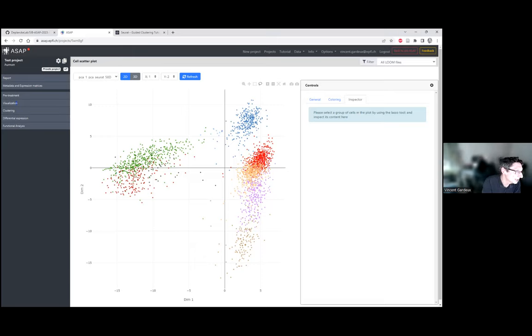Then ontology, super nice. Thank you. Surface marker is nice. Thank you. TF and surface markers, they come from gene ontology. Yeah, Fabrice already answered that.